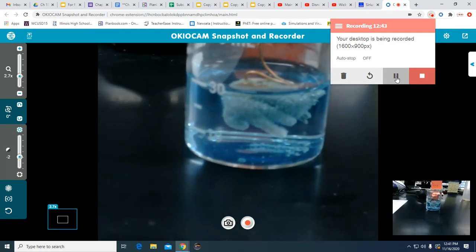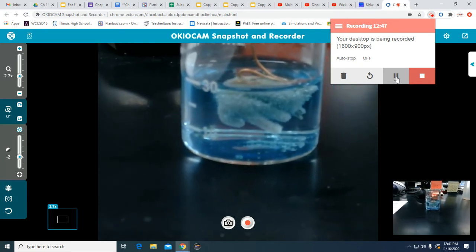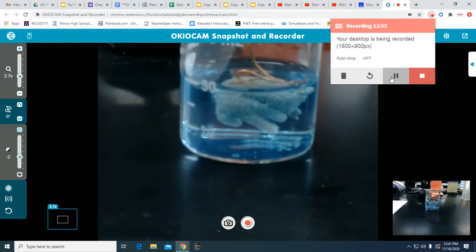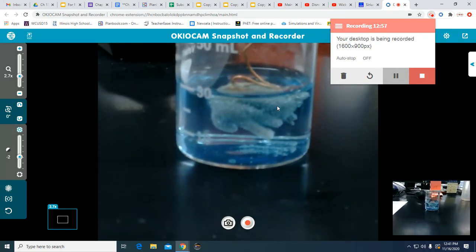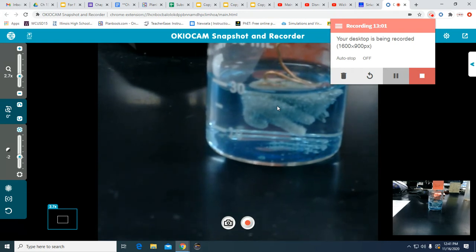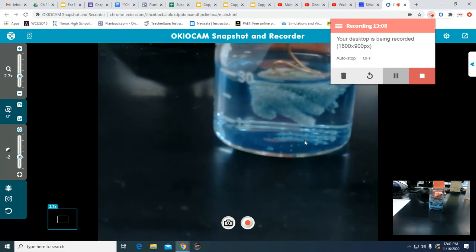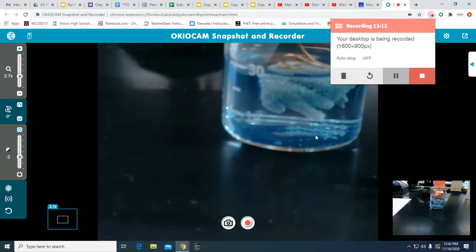All right, we're at about the 10-minute mark or so, and not a whole lot has changed since about 5 minutes ago, with the exception of the water being a little bluer, a little darker, and just a little bit more silver fur forming, if you will. I don't know how much is going to happen from here on out. As you can see down here, I already have some silver being, what we say, lost during the process.